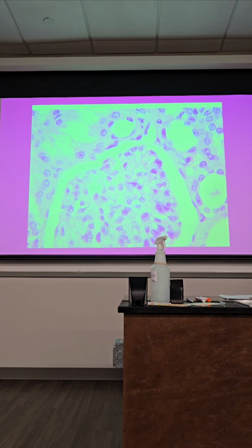Why is it that way? The lumen of the DCT is clear, and for the PCT it's kind of cloudy in the middle, cloudy because of the microvilli. I was covering this part on the quiz. It doesn't have to be in the middle. It'll be all over here, all over here, all over here. That's why I miss it.